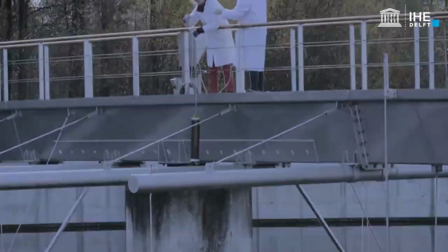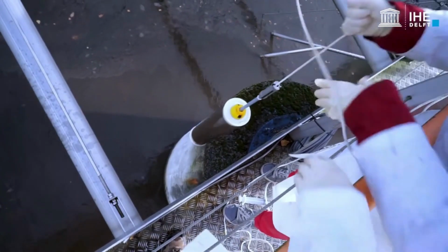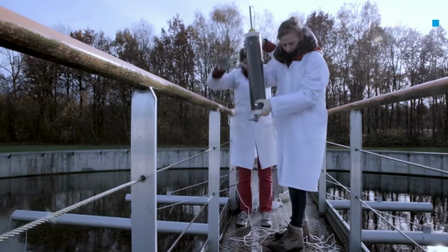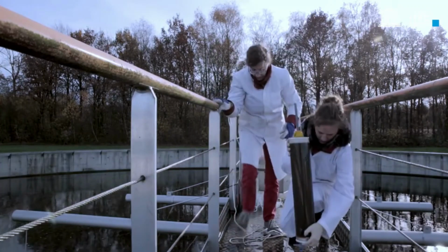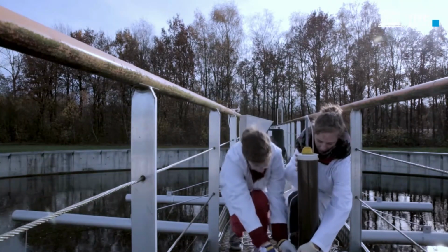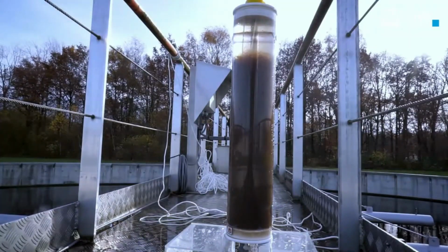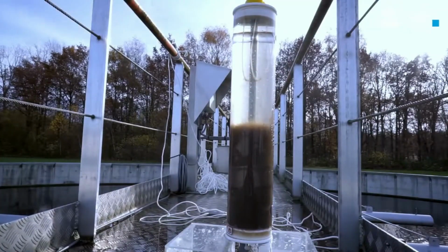Pull the sample up. Make sure to keep the sampler upright. Stabilise the sampler near the sampling location and allow the sample to settle for 30 minutes.